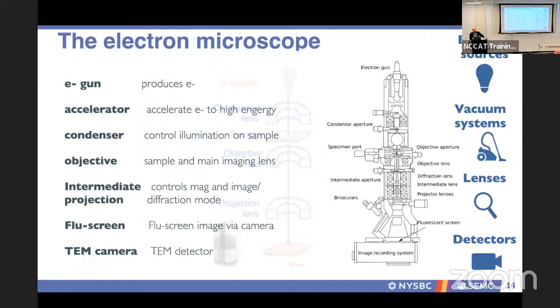And if you're doing microED, you can pull some of that out and put your back focal plane onto your projecting plane and see diffraction. There's something known as a fluorescence screen. Back in the day, you actually had oculars, as you see in there, binoculars, but now that's a camera looking at a flu screen.